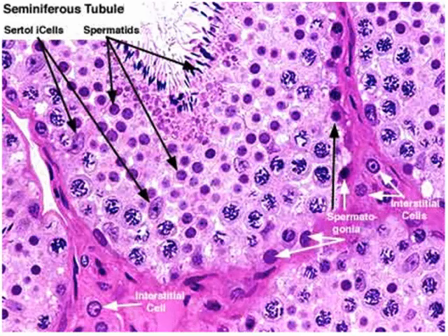This next slide, you easily can see the immature sperm cells, and you can see their nuclei extended out into the lumen. And I can tell this is mouse sperm because you can see the little long, skinny, hook-like nucleus. So that was a little different than in humans.